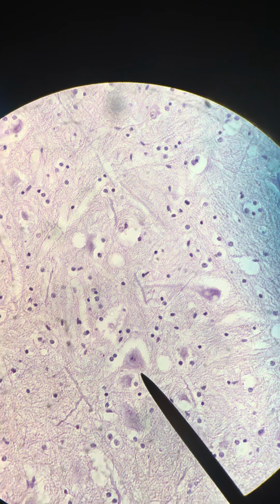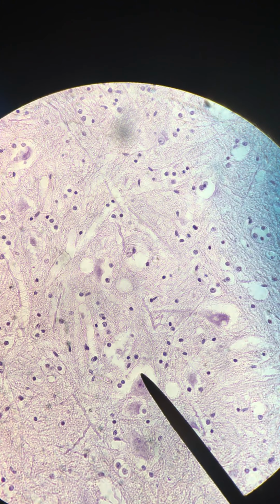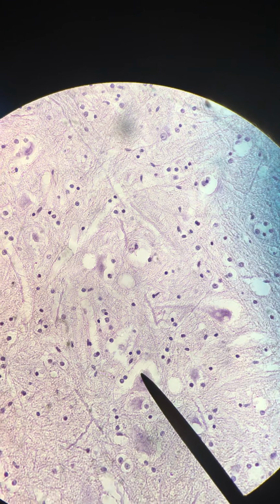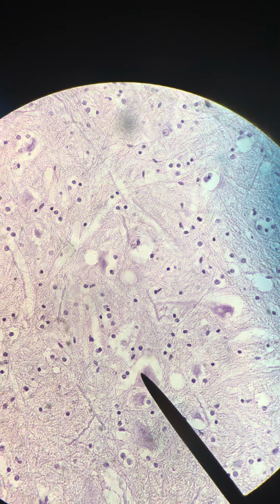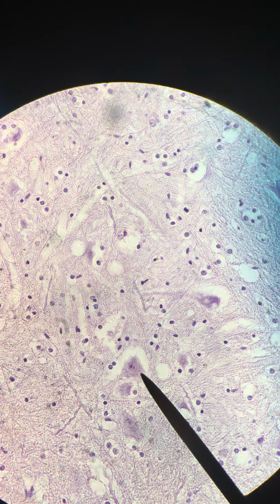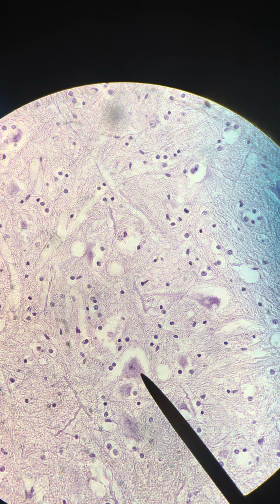And because we can see some staining, we know that that is a dendrite, whereas it almost looks like there's an appendage that would be coming off here, but it's lacking staining, and that indicates to us that it is the axon because of the absence of Nissl substance, which is picking up that coloration. Okay, so this is our neuron.